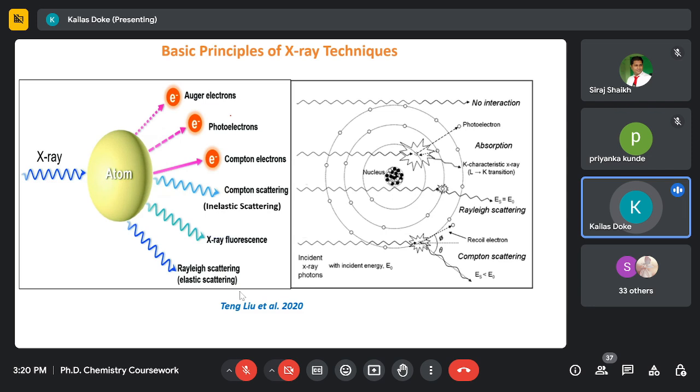For example, in the next figure, this is an X-ray, and if this X radiation does not collide with the target material, there will be no interaction, no change in direction, and no scattering. But if the X-ray is incident on a solid material and collides with a valence electron, the electron is ejected, and that electron is called a recoil electron or Compton electron.